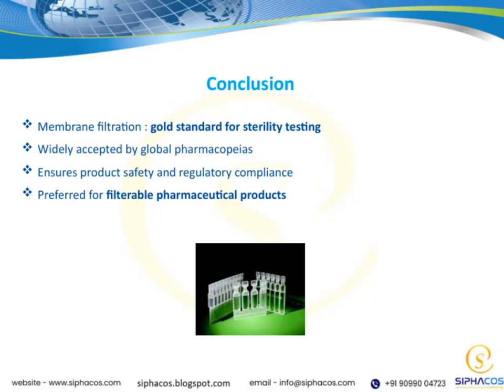Membrane filtration has truly become the gold standard for sterility testing. It's widely accepted by global pharmacopoeias, which highlights how universally trusted and standardized this method is. This technique not only helps ensure the safety of our products, but also keeps us in compliance with regulatory requirements. When it comes to filterable pharmaceutical products, membrane filtration is the preferred method, mainly because of its efficiency and reliability. So, in the overall context of sterility assurance, membrane filtration stands out as the most effective and trusted approach.